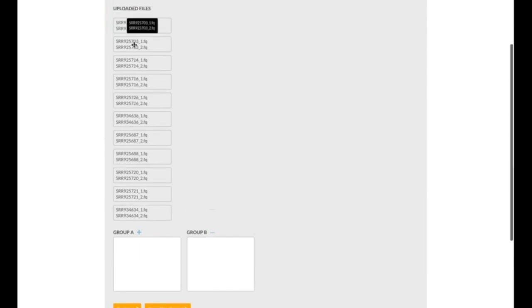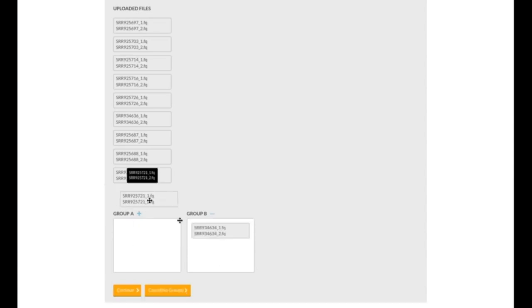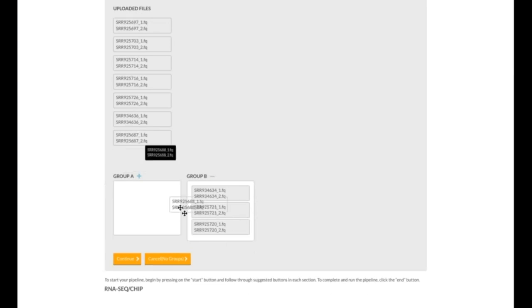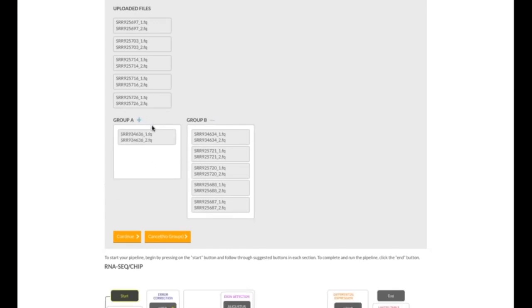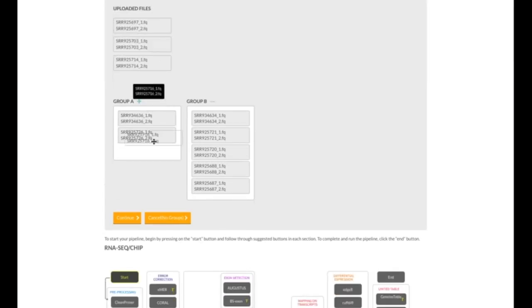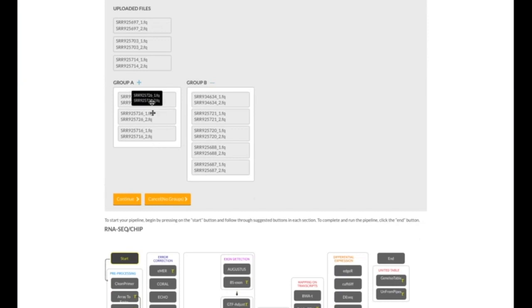So we'll have two groups. How many do we have? 1, 2, 3, 4, 5, 6, 7, 8, 9, 10, 11. So 11 samples total. The bottom 5 are going to be in group 1 or group B, and the rest in group A. So if you just drag them like this, it worked?